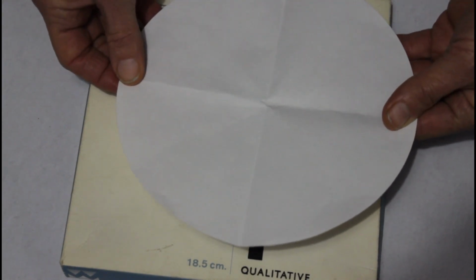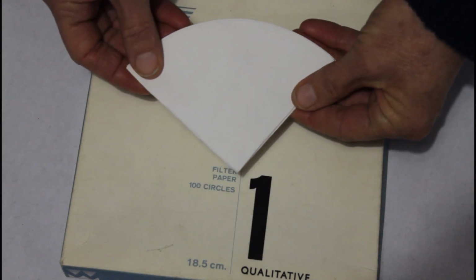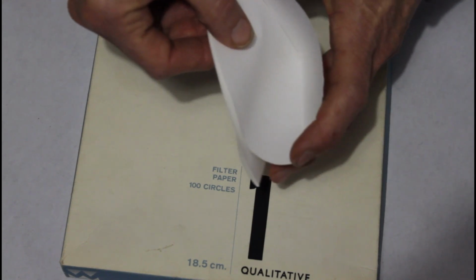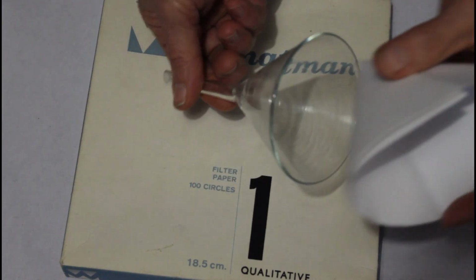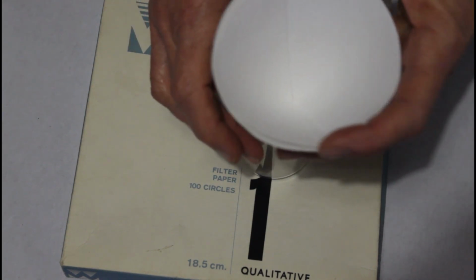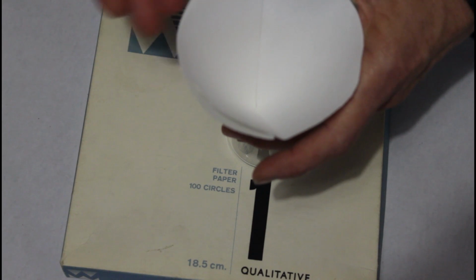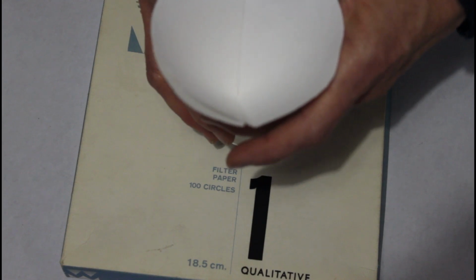So watch carefully. Quite simply, you fold it in half, and then you fold it in half again until you have got a quarter circle, and then we take 3. Can you see? We take 1, 2, 3 on one side and 1 on the other, and now we get a nice little filter. Then I take a scientific funnel and we'll pop it into the funnel, and now we can pour our sample in there. I've got a beaker and we'll just stand it in the beaker, and then we can separate anything that is perhaps finer than sand, maybe something like flour or our chalk sample, quite easily by putting it into filter paper.